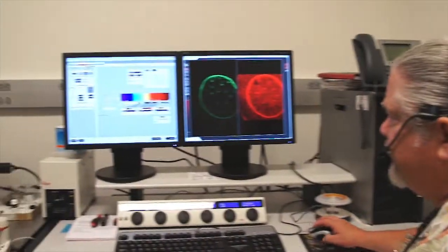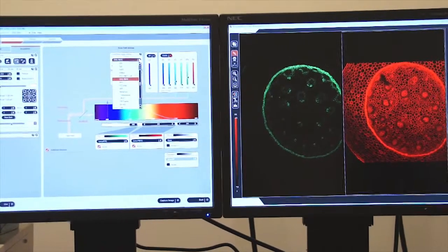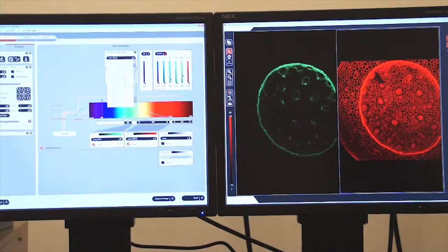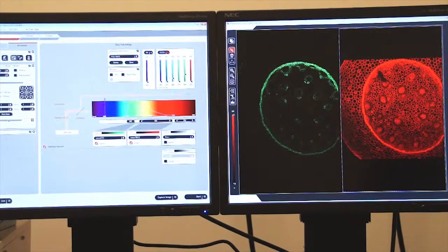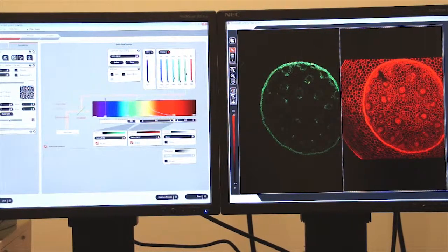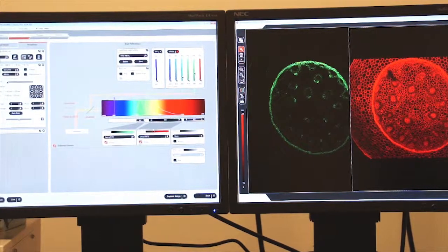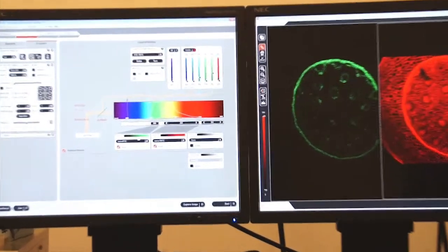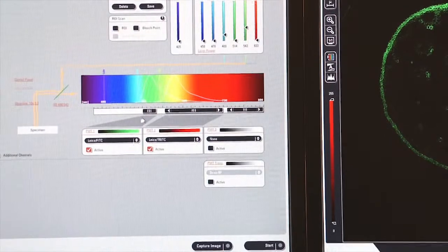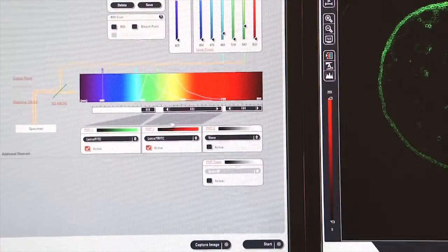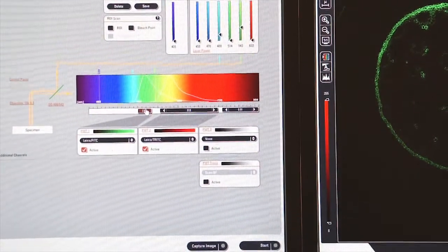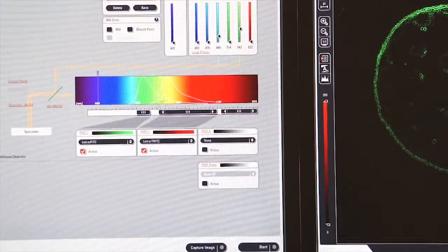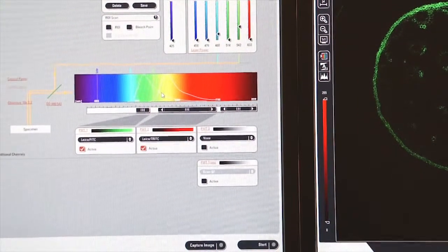In this case, we have selected Fitsy Tritsy from our pull-down menu, which activates the proper lasers with the proper amount of power. It turns on the photomultiplier tubes. Here you can see the first photomultiplier tube engaged with a gray line that shows it's turned on, and the second photomultiplier tube. Each one is set to receive information from the emission spectra generated here on the screen.